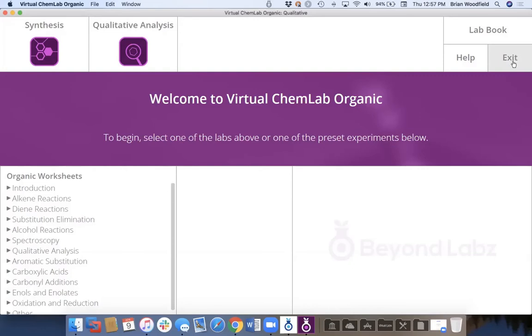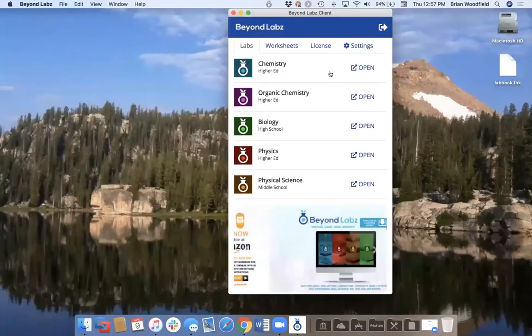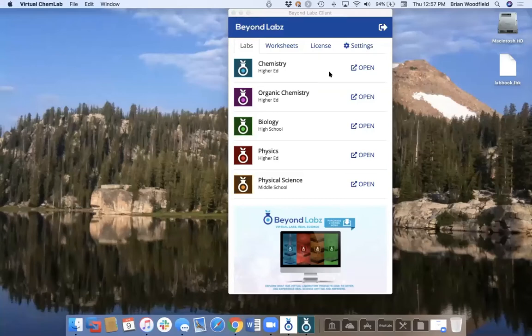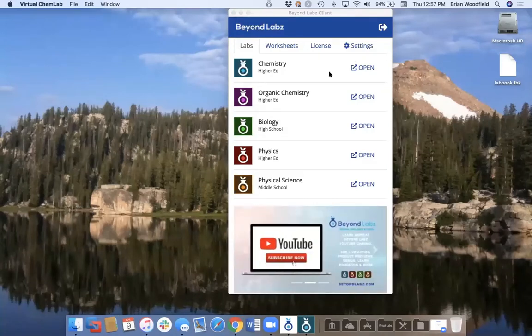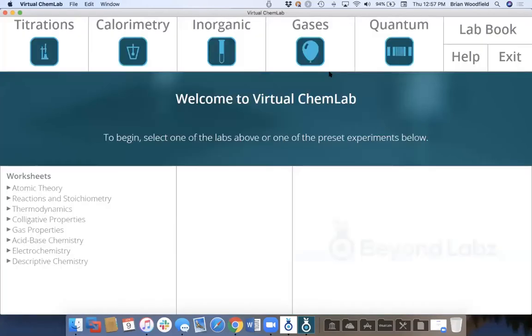Thank you. So Brian, I have a question, please. Now they're going to upload their unknown lab book to Canvas. We use Canvas, and we have to go through Canvas and open up Beyond Labz to actually access those notebooks. And then we can put a grade. Yeah, it actually goes really quick.